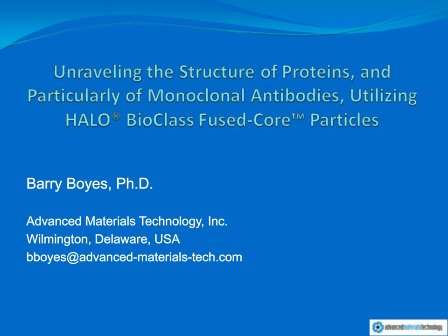Okay, thank you, Steve. Sorry for that long-winded introduction. Today we're going to be talking about essentially liquid chromatographic and mass spectral methods to study the structure of proteins, and these will be exemplified with some applications regarding monoclonal antibodies.